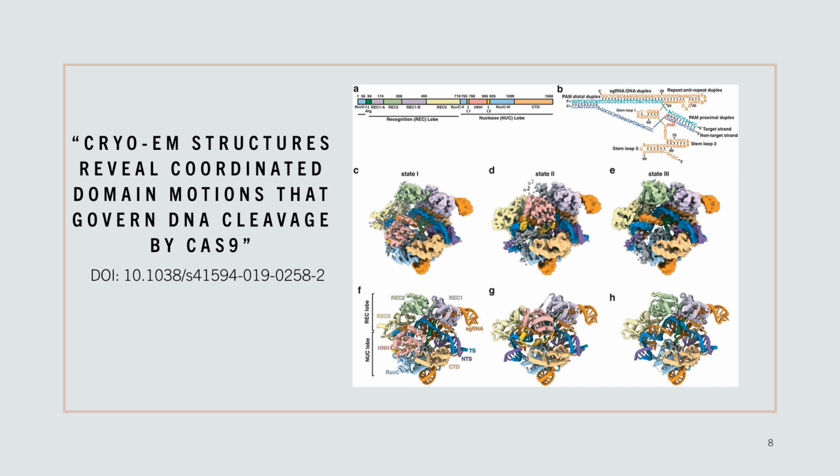This figure is from the paper Cryo-EM Structures Reveal Coordinated Domain Motions that Govern DNA Cleavage by Cas9. This paper was using cryo-EM to see different states of the Cas9 endonuclease, which gave new insights into the domain motions and interactions between the enzyme and nucleic acids.